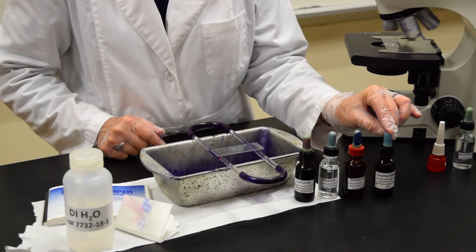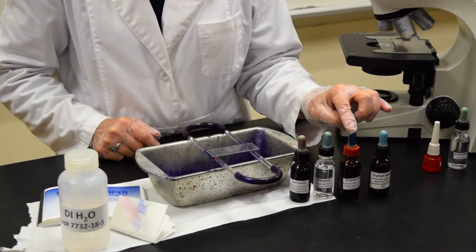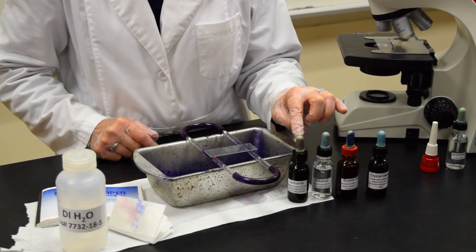You'll need four reagents when doing a gram stain: the crystal violet, the gram's iodine, ethanol, and safranin.